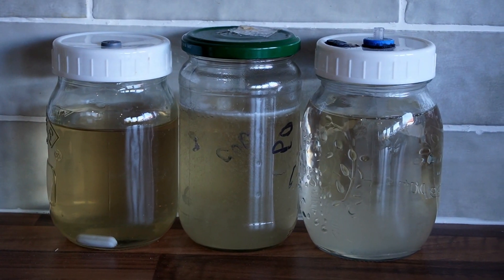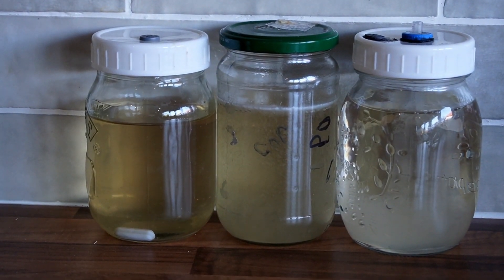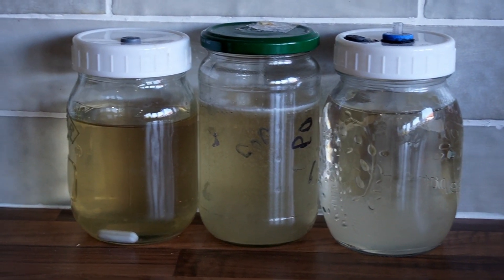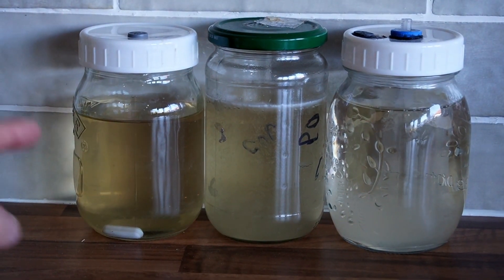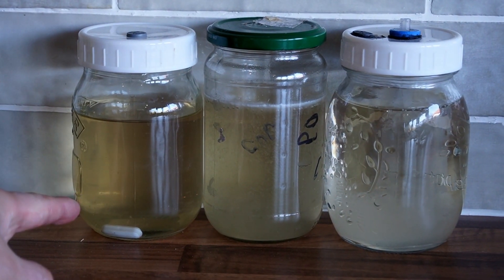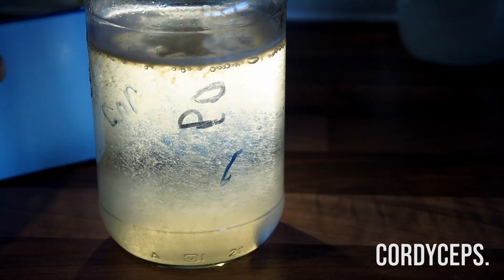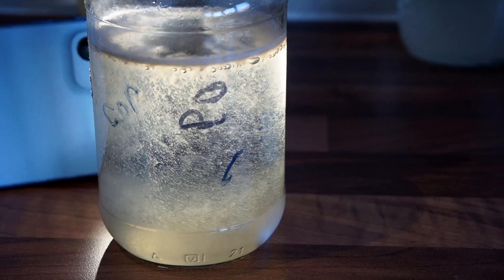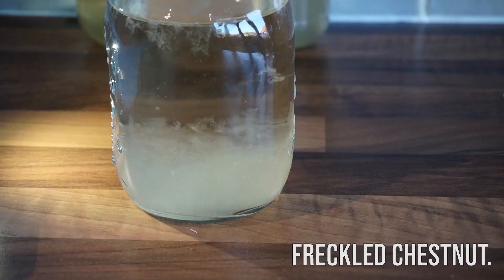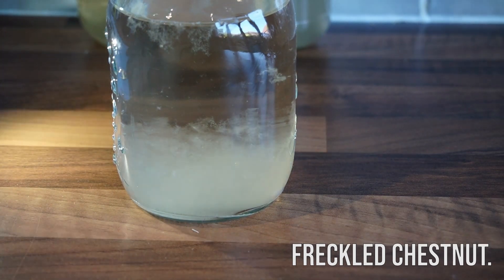This is what the jars look like after they've been grown for a couple of weeks. The one on the left I only injected with one cc of shiitake and didn't shake the needle properly, so it hasn't had much growth. The middle one is cordyceps — it's a bit crazy, it sticks to the edge of the jar and is really difficult to get off even with a magnetic stir bar. The one on the right is freckled chestnut and that has grown perfectly.